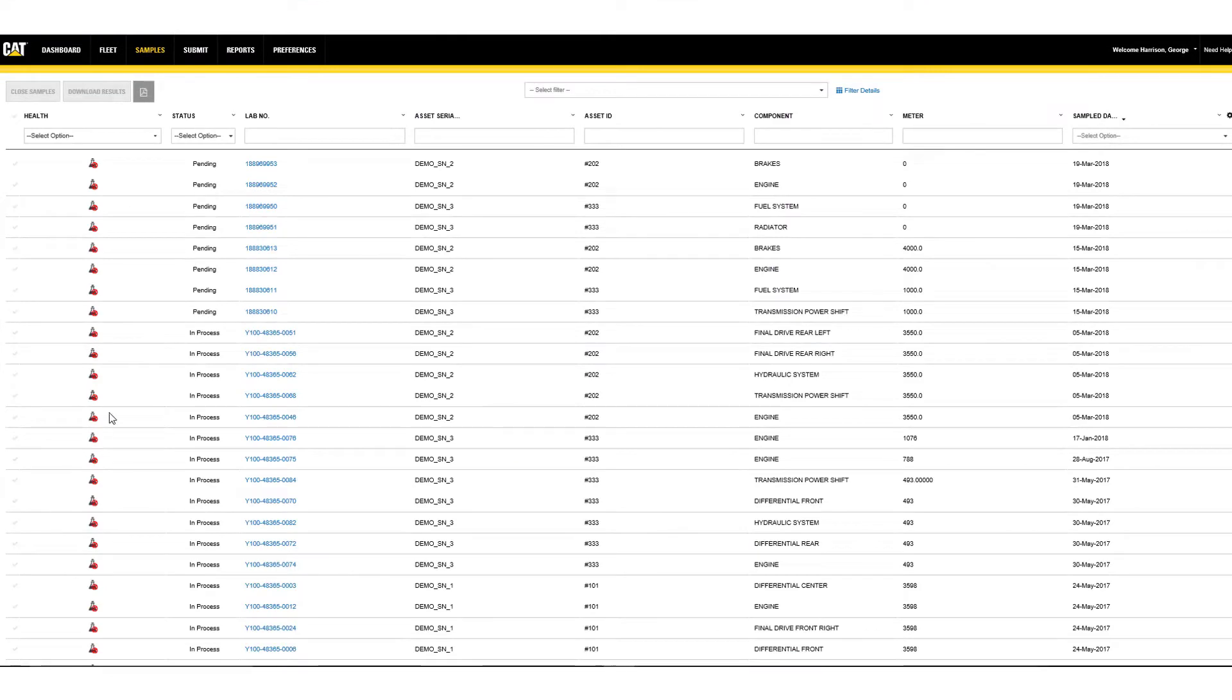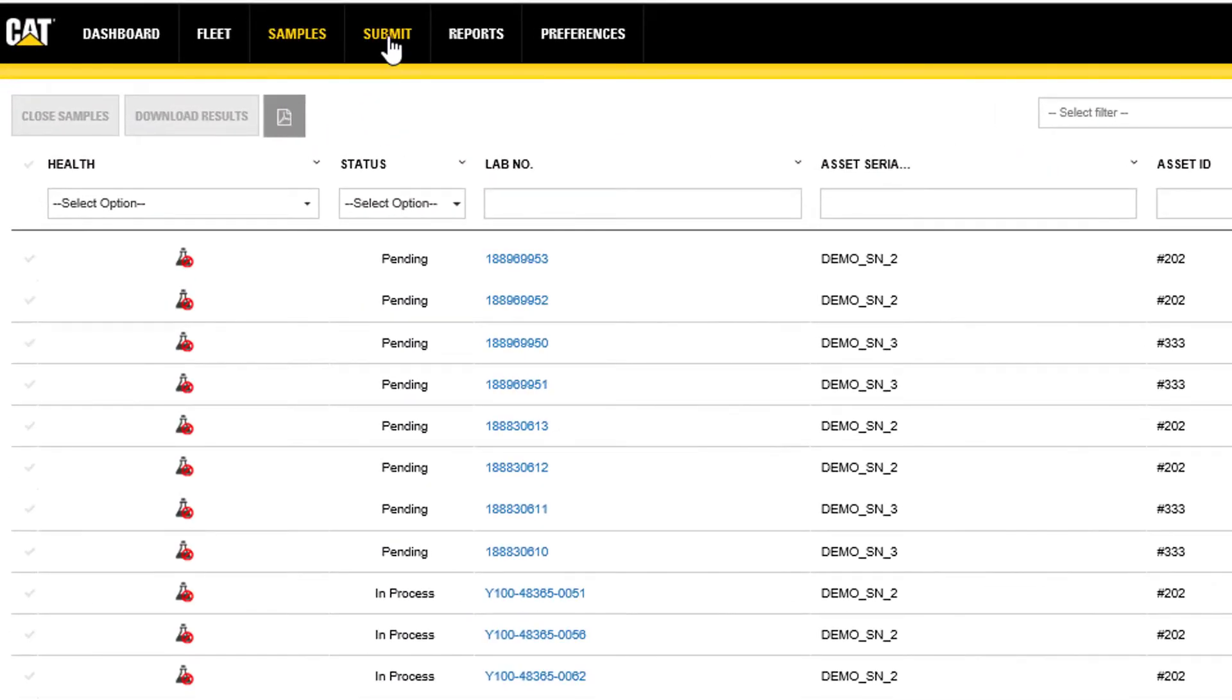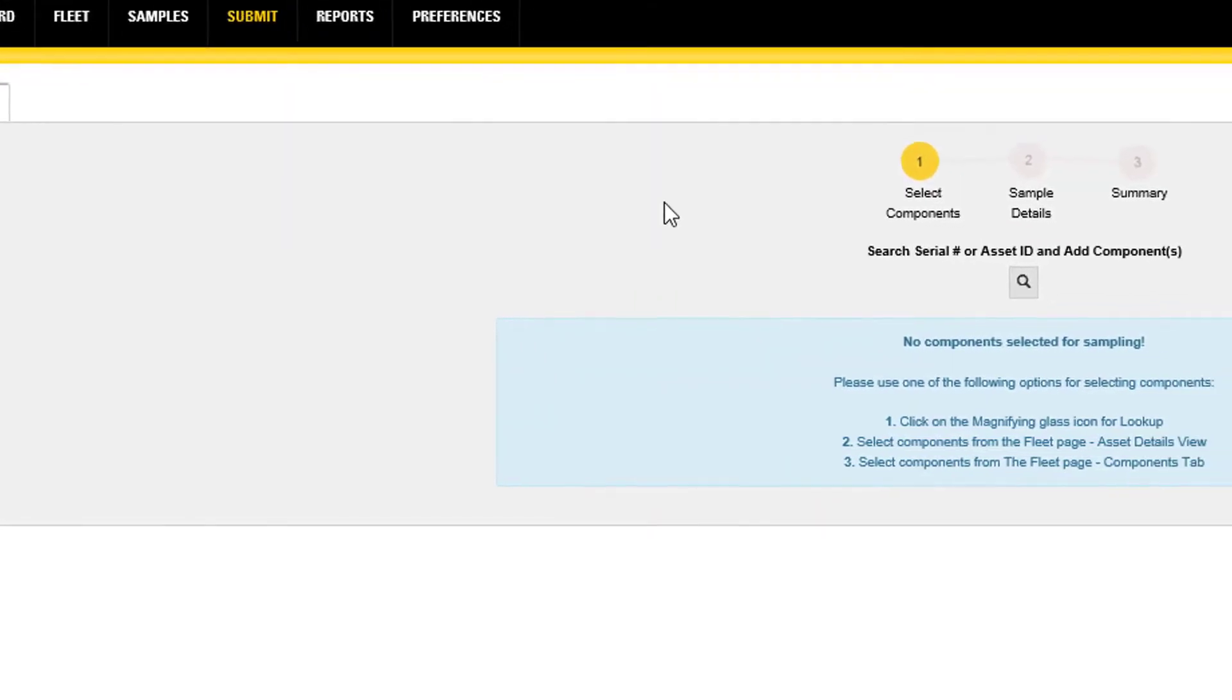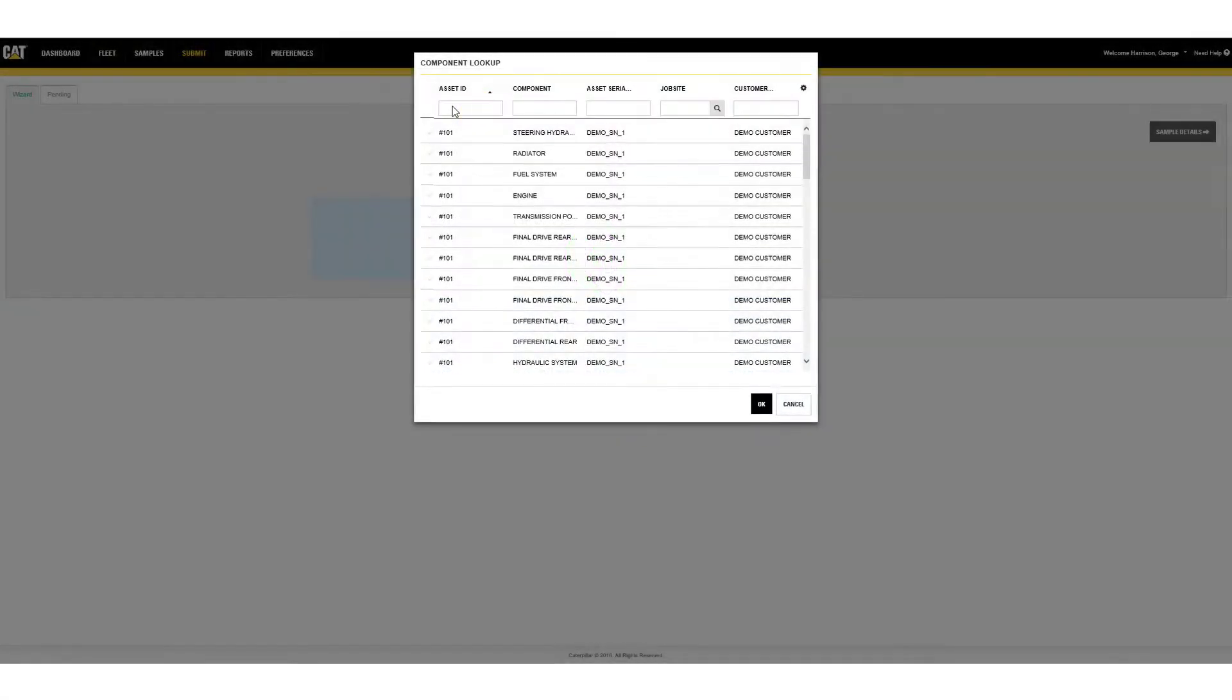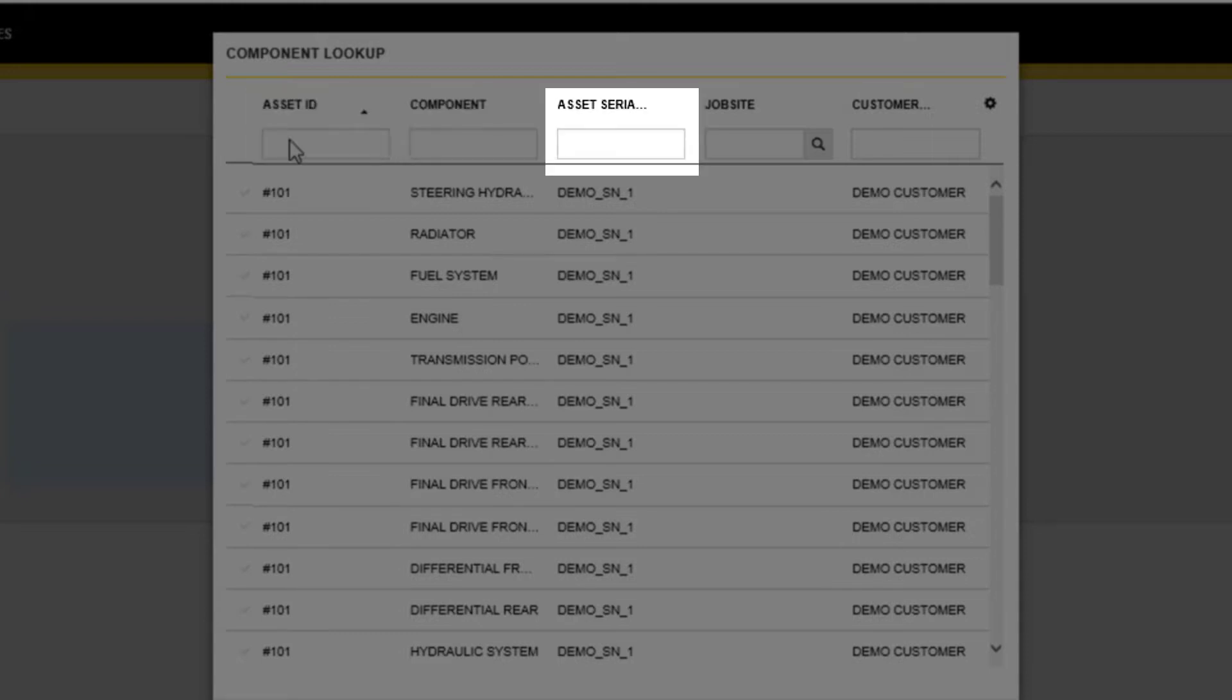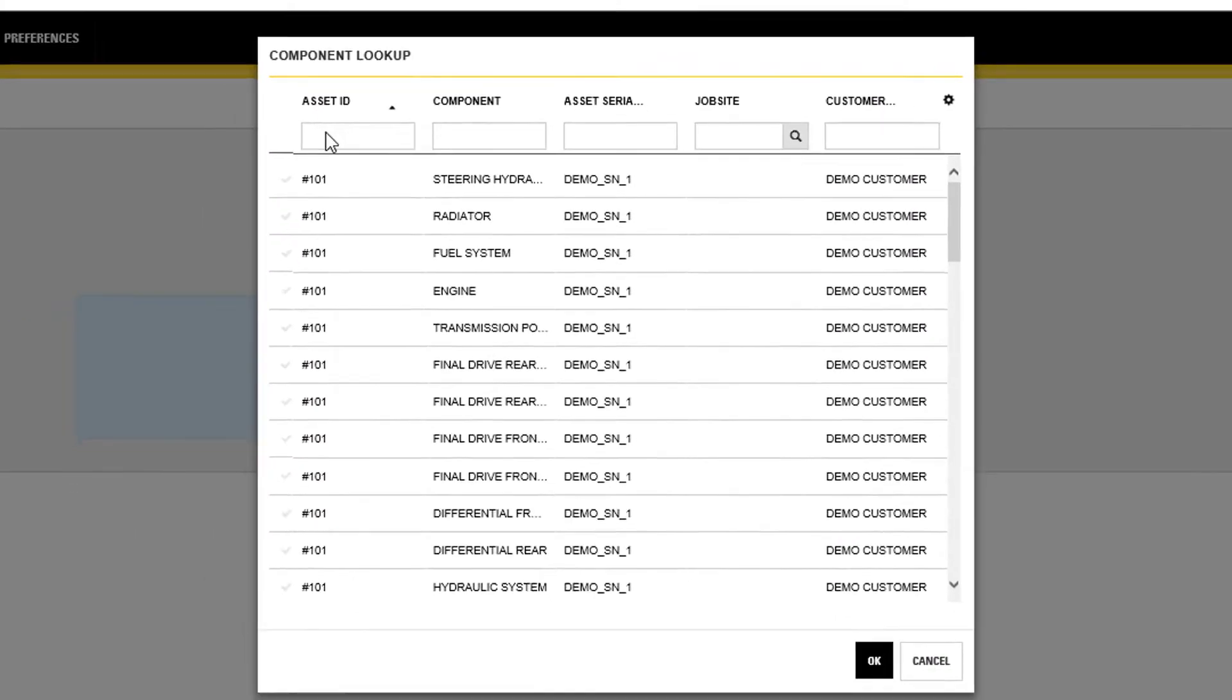Once in the SOS Application, click on Submit to access the label wizard. Create the list of samples to register by clicking on the magnifying glass search icon. You can search by asset ID, component, asset serial number, job site, or customer name to obtain the needed components.